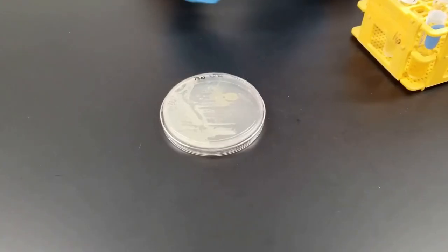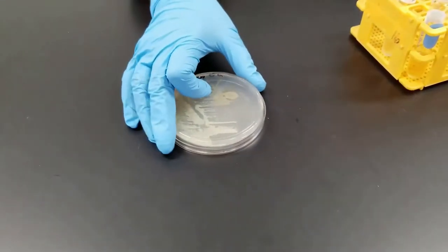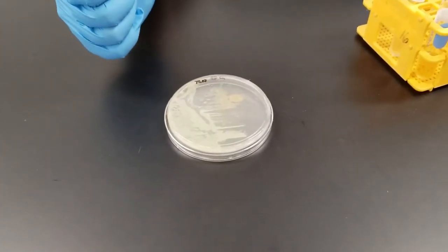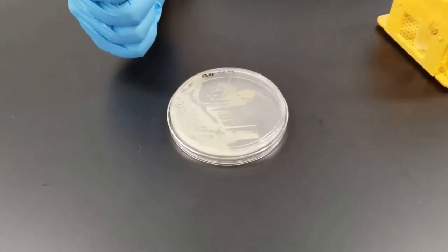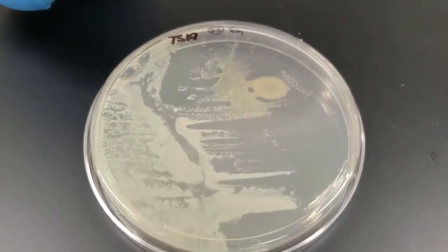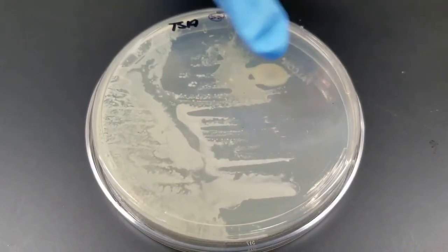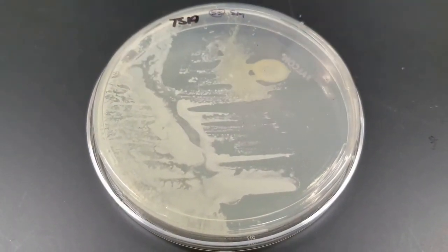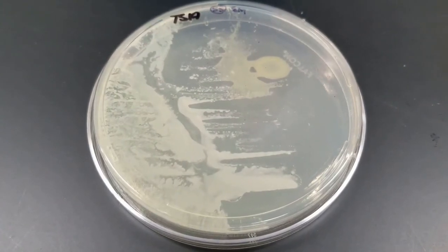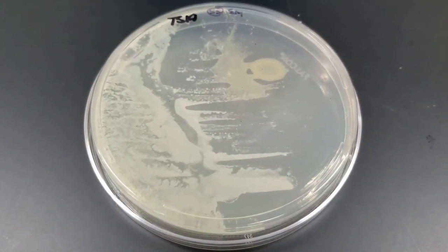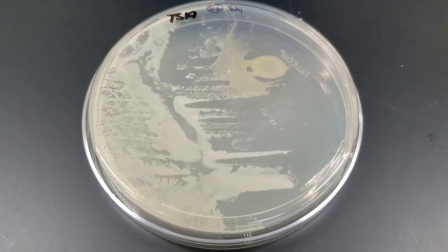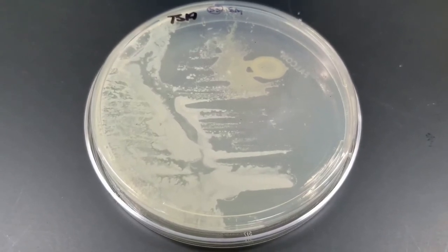So we have a plate here that had been inoculated with Serratia marcescens. This was grown at 37 degrees. So we do have good growth there. Colonies are small, relatively small, tend to be round, smooth edges on them.